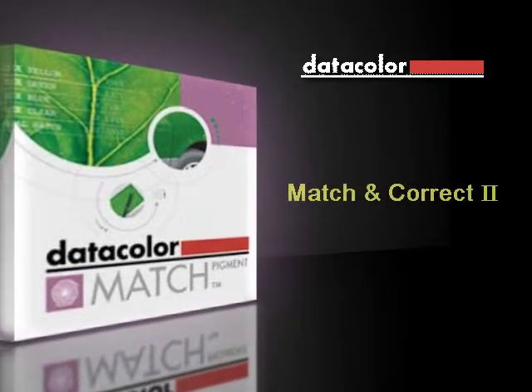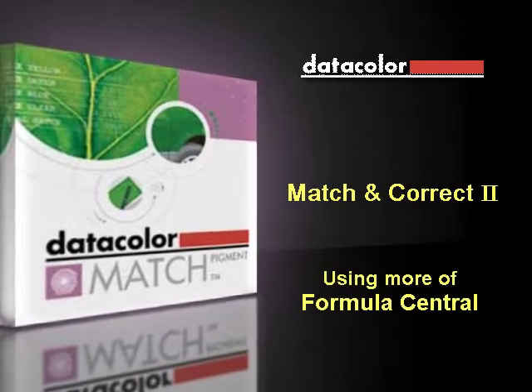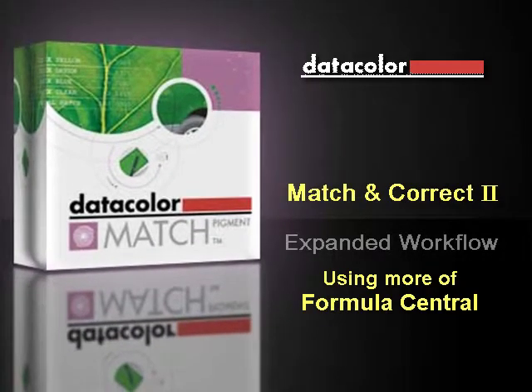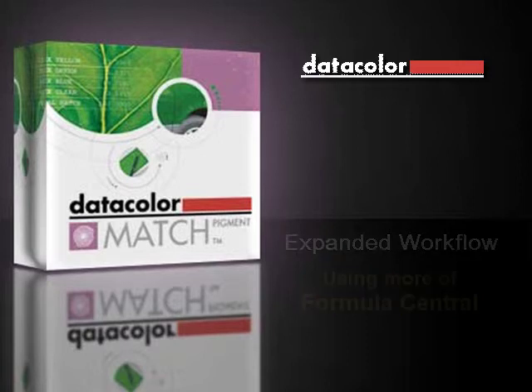Hello, and welcome to the second in this series of video tutorials on using Datacolor Match Pigment for matching and correcting color. Today, I'll show you tips and features to expand your basic workflow. You'll see more matching tools, the job notebook, and I'll show you how to use different types of matching constraints to help you give your customers exactly the results they want.